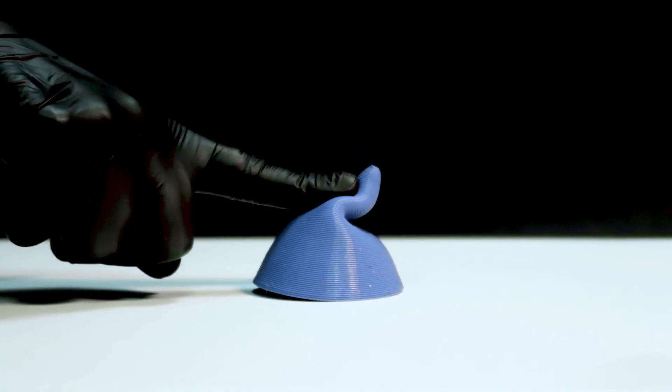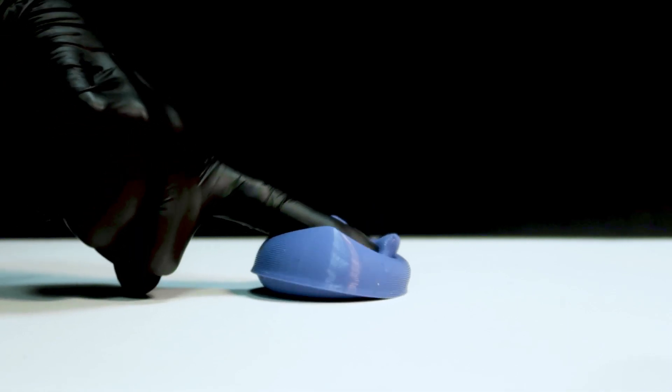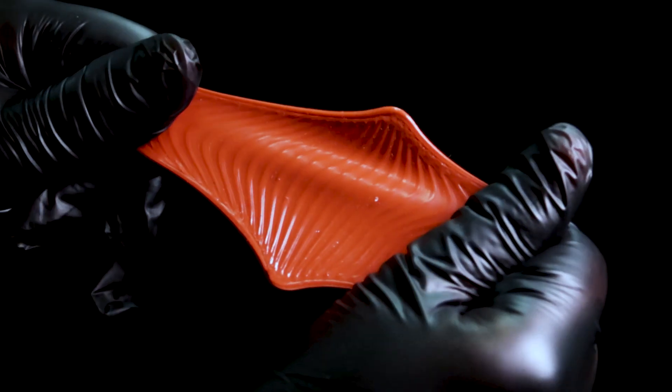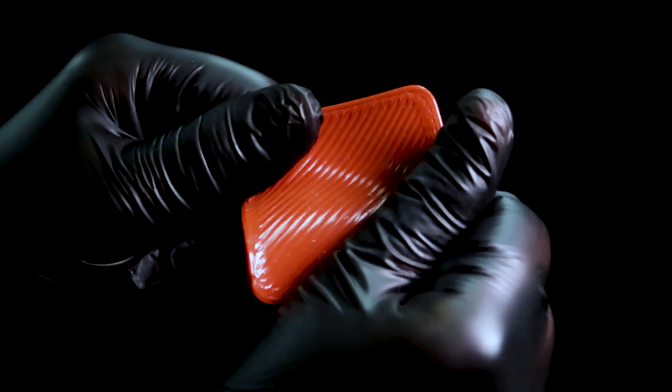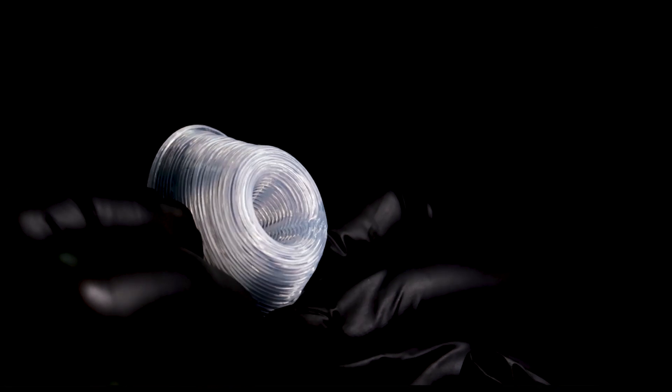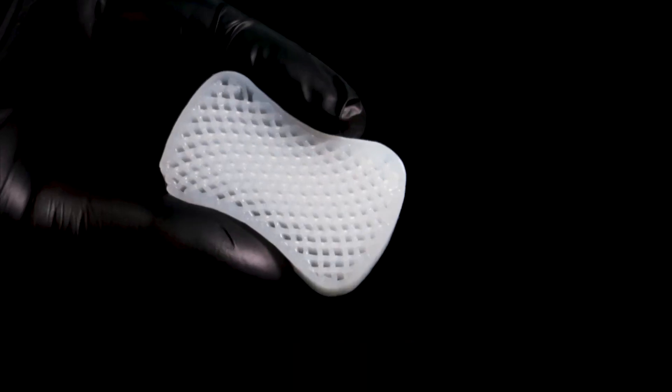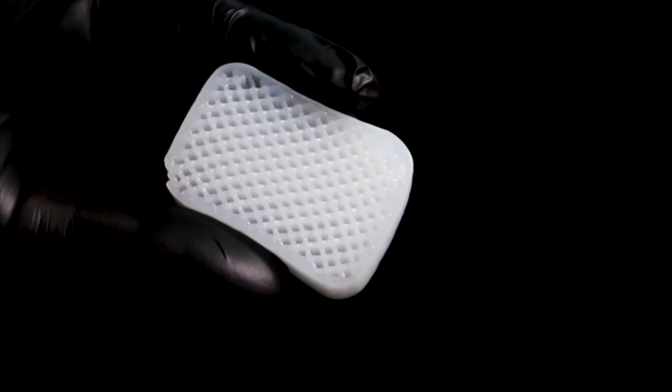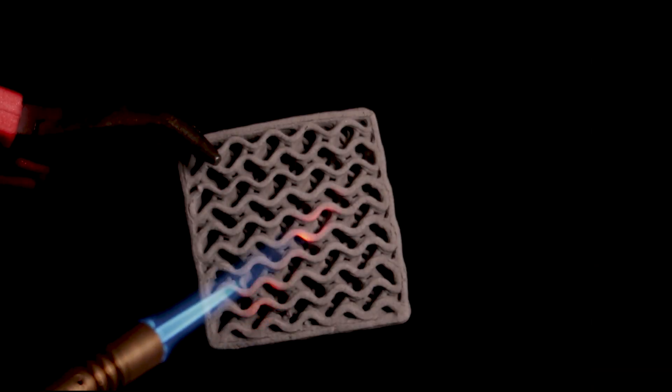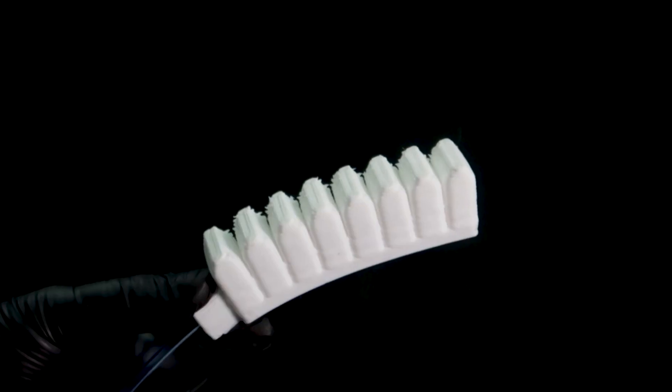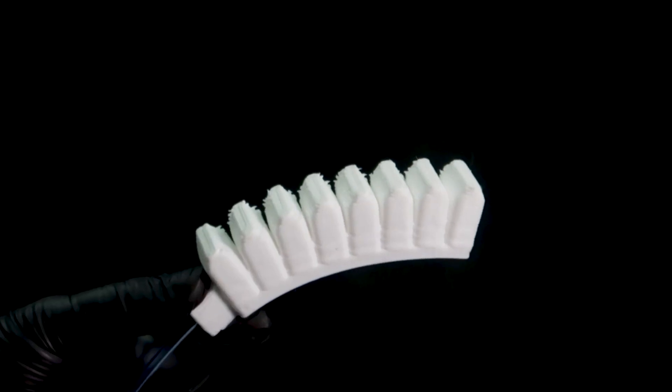As a versatile DIW 3D printer, FNES is a perfect fit for teams working on new materials, flexible electronics, ceramic insulators, silicones, or conductive pastes.